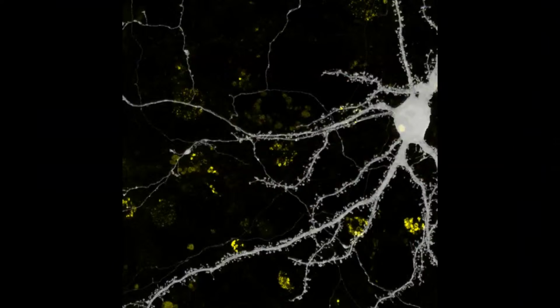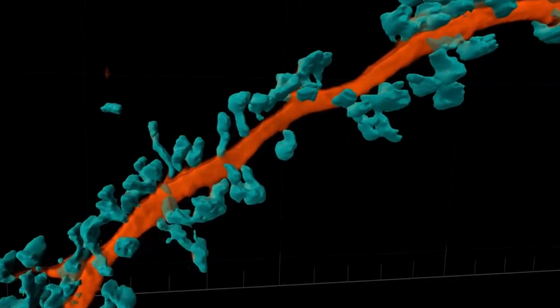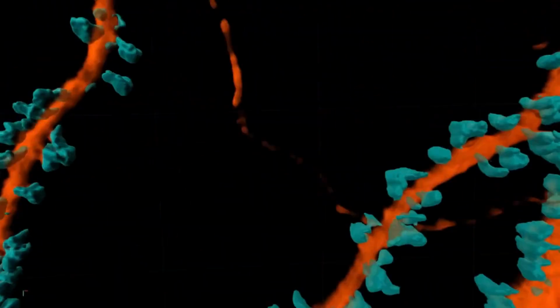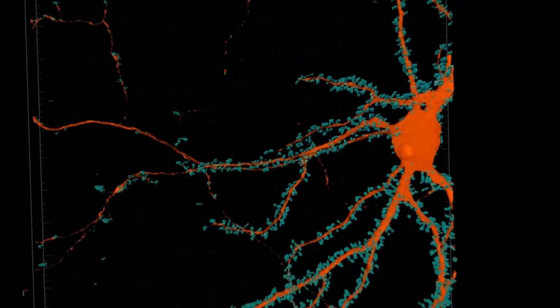What's up on the screen is one single neuron that was imaged on the CD7 using the water immersion objective, which is the 50x with the NA of 1.2. And this one neuron was segmented using our ZEN segmentation software. So what you saw playing was the segmentation with the software.